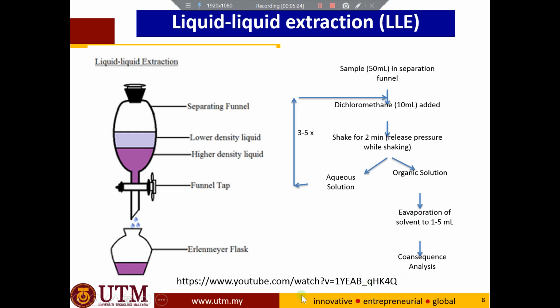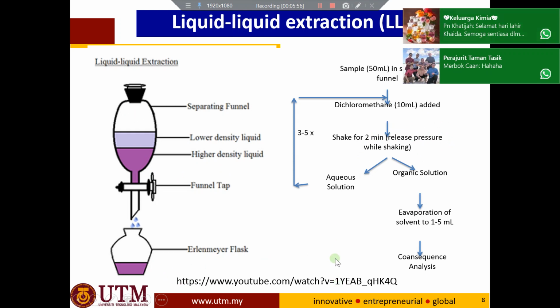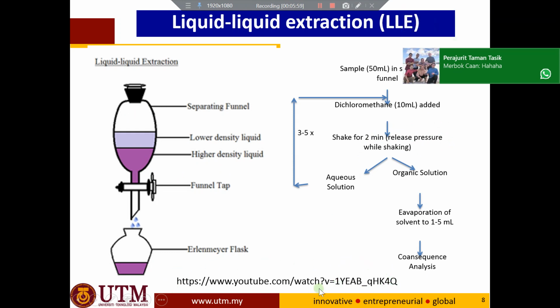You can click using this link to go to the YouTube channel from somebody else to learn how actually liquid extraction is done. But here is the normal procedure lah. Again I need to mention it's really important for releasing the pressure. So how to release the pressure? You can look into the YouTube channel over here.